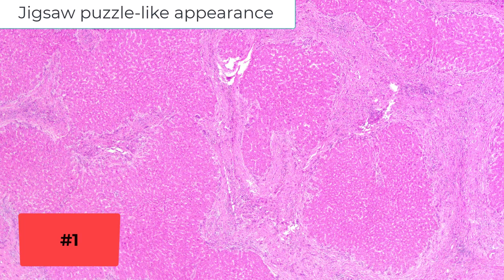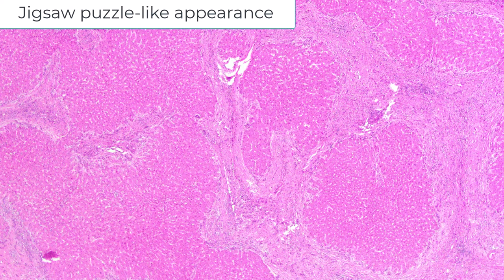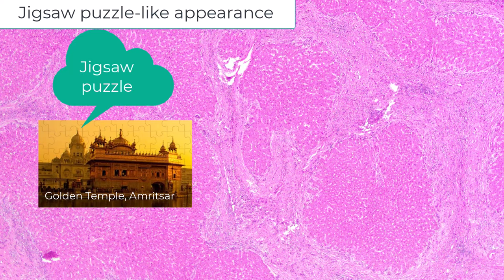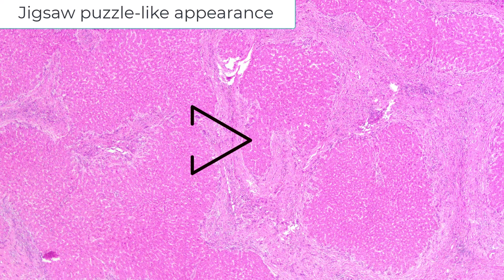The low-bar appearance of chronic cholestasis-related cirrhosis is very characteristic. It essentially looks like a jigsaw puzzle. And here is that jigsaw puzzle-like appearance: nodules of regenerative liver shaped like pieces of a jigsaw puzzle, surrounded by all of this fibrosis.